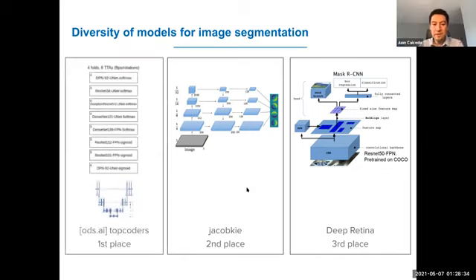And finally, in the first place, the type of architecture that they used is a classic one. It's called the U-Net. Maybe you have seen it in other works. The basic idea here is that you take the image and you compute representations all the way down to a lower resolution or even a single feature vector. And then from there, you decode that representation back into a full resolution image. It's an encoder-decoder architecture with skip connections between the multiple resolutions.